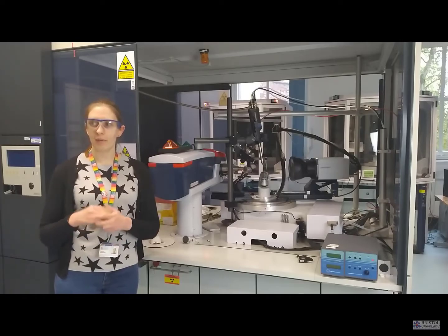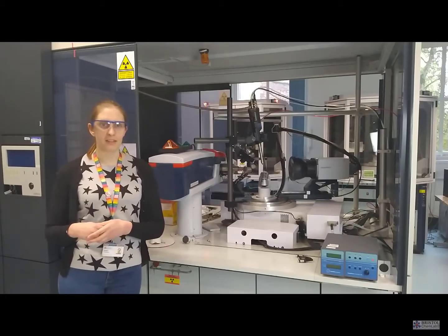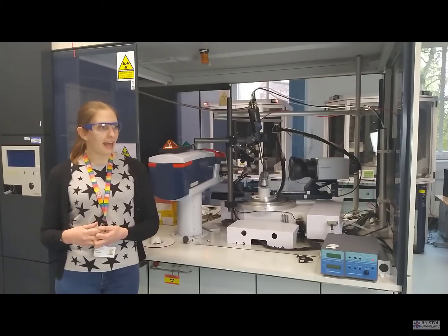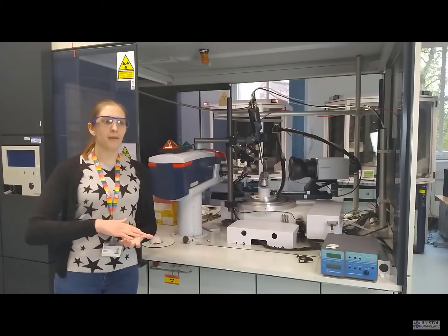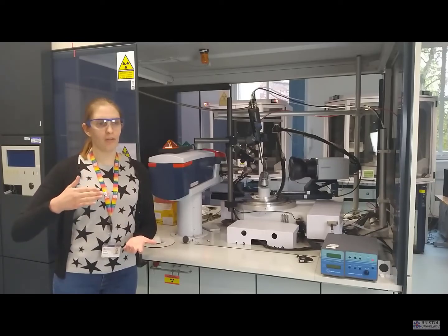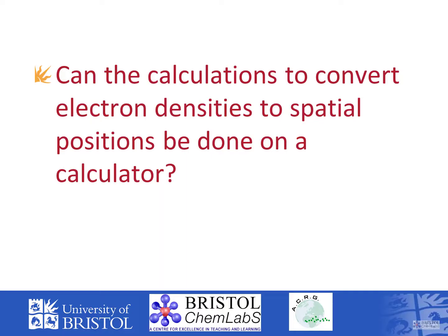For the powder, it's an hour for the instrument training, and before that there's also radiation safety training. For the single crystal, it's a few hours, so normally about half a day for the initial training, but then you'll be supervised the first few times you use it until proven competent enough to then use it on your own. So it's a little bit more complex for the single crystal instruments.